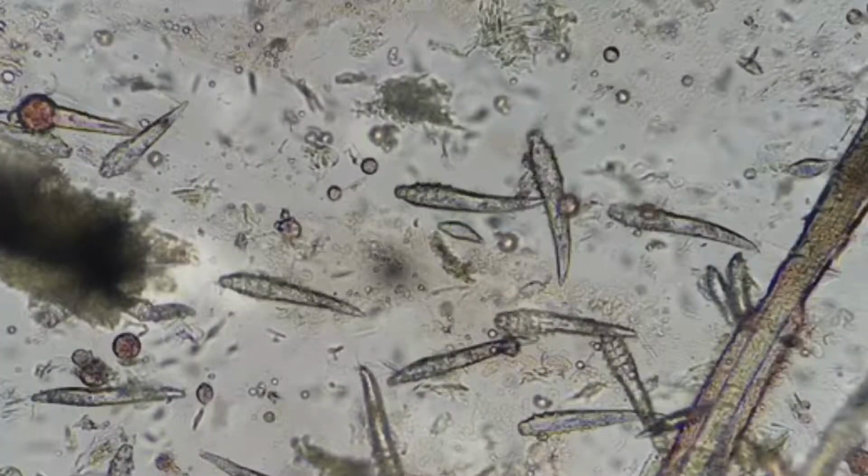In this video, I am going to talk about trichogram and its importance, and also how to interpret it. This test should be done if your patient has alopecia, to rule out self-induced alopecia, to differentiate normal hair loss from abnormal hair loss, when you suspect dermatophytosis or color dilution alopecia, and as an alternate test instead of deep skin scraping in diagnosing demodex mites.